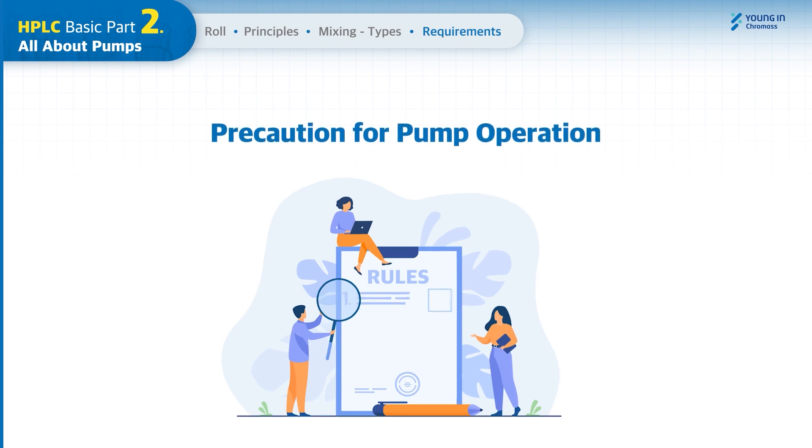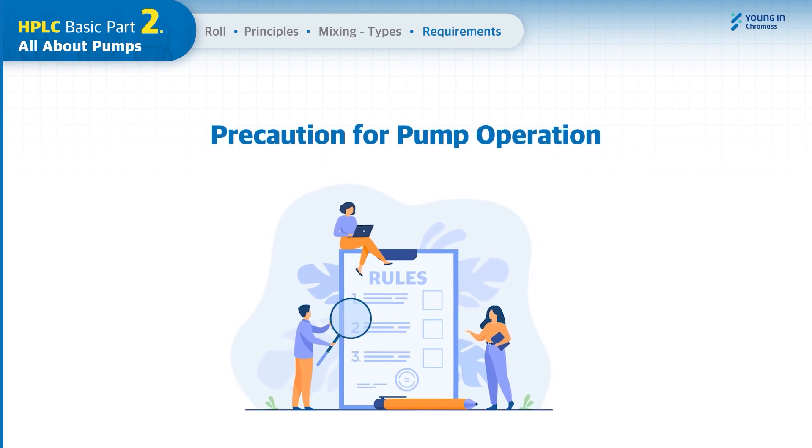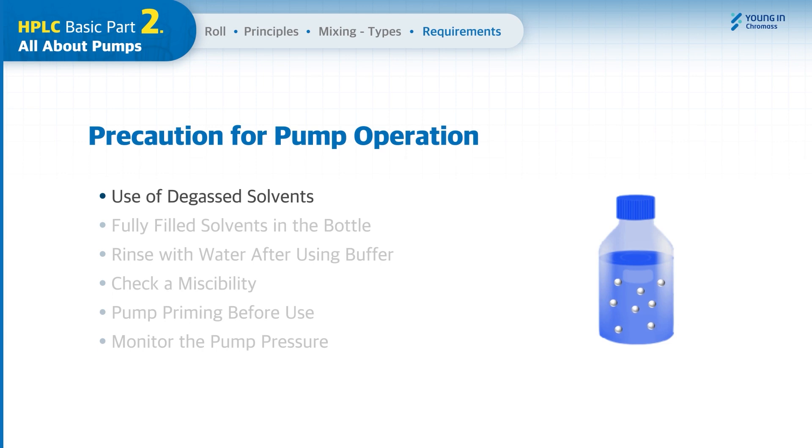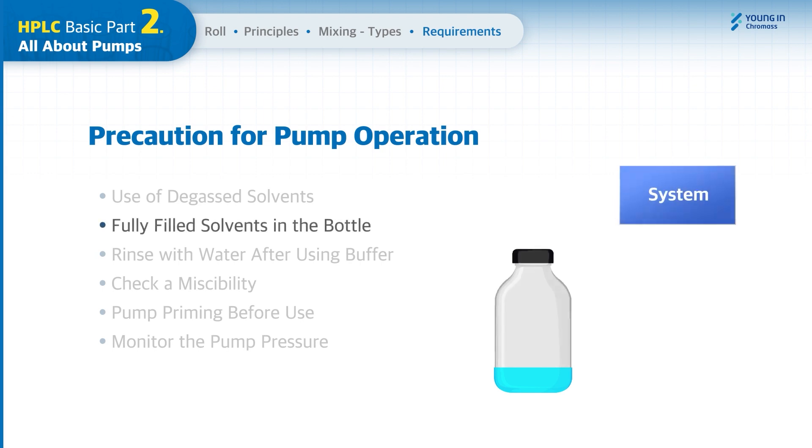There are some things to be aware of when operating an HPLC pump. If you use solvents with air bubbles, flow fluctuation will occur, resulting in poor repeatability. Therefore, all solvents used for HPLC must be degassed. When using nearly depleted solvents, the solvent will run empty and air bubbles can be introduced to the HPLC system.